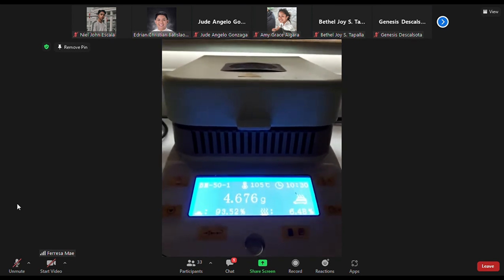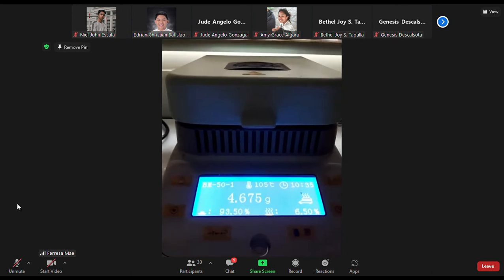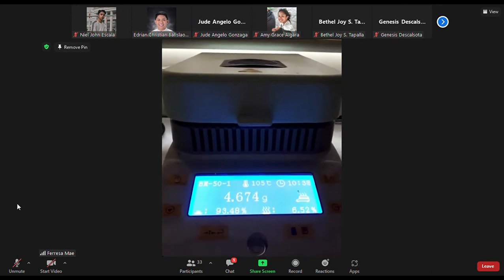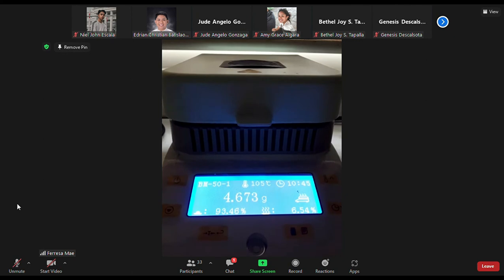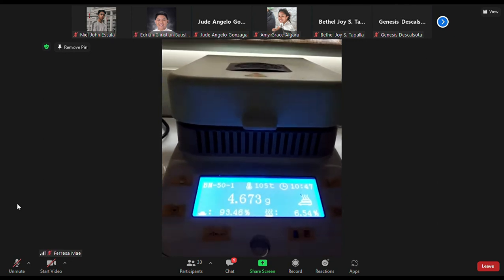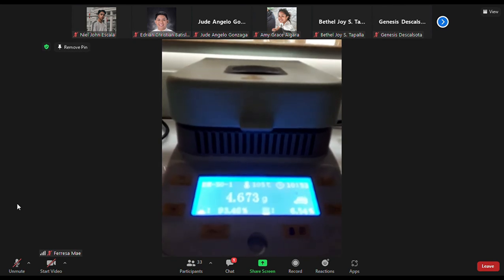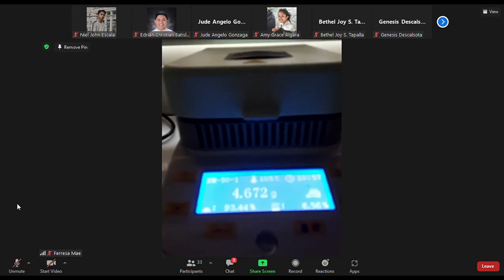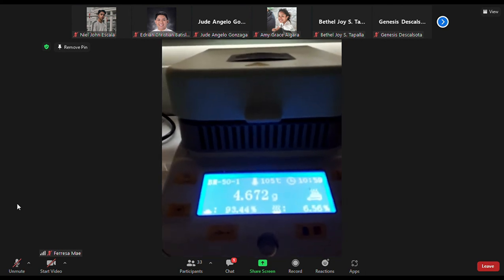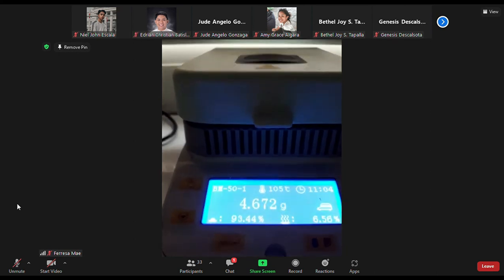Okay. So, more or less, pareha na siya supposedly ang outcome, but the method is different. So, you cannot compare the same values sa different method. Okay. So, kung gusto ta nga i-compare, you do the conventional one. Tapos, i-compare mo ang results sa conventional and the rapid test. Okay na? Okay na Miss. Sige.